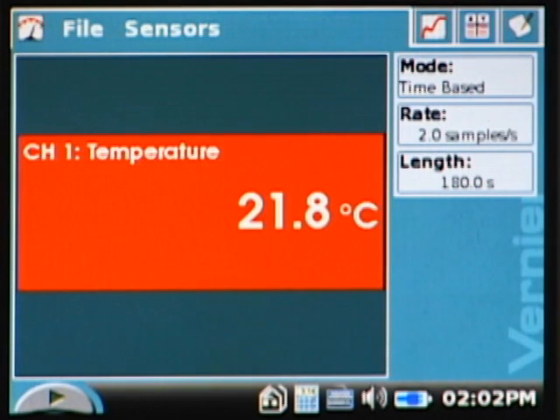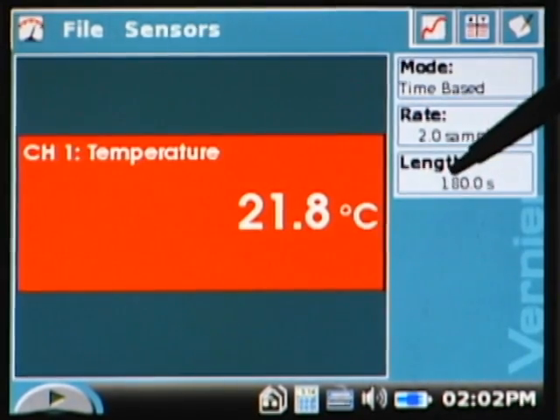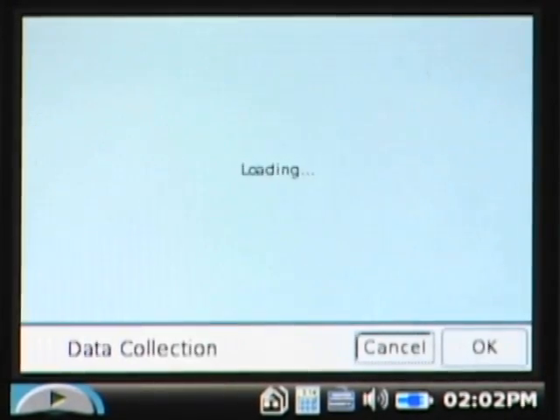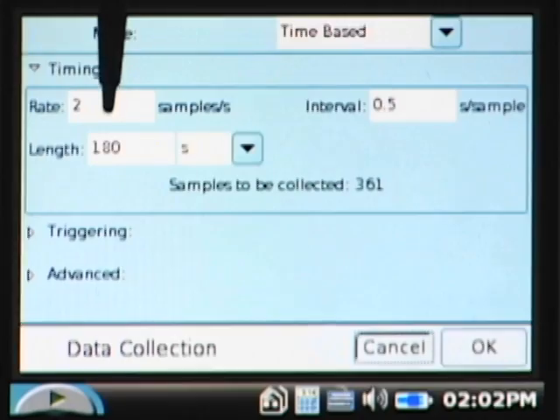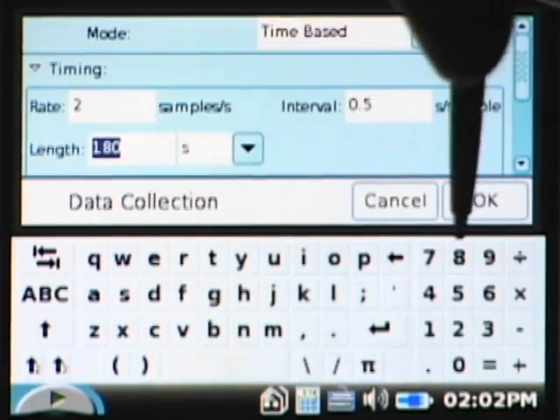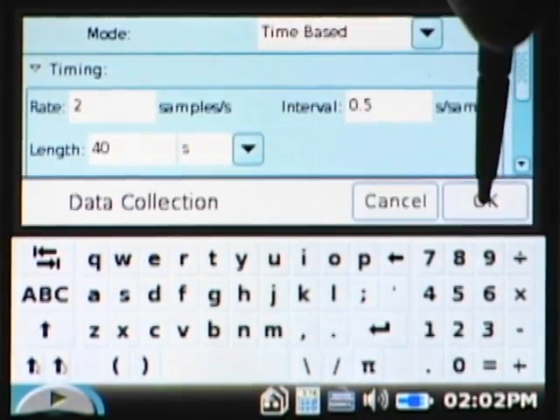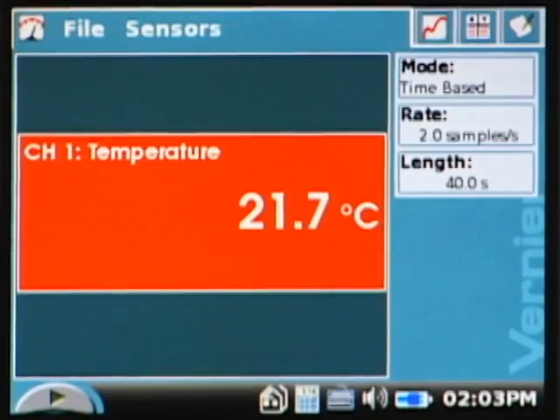In the lab, it doesn't want us to use that long of time, so we need to change that to 40 seconds. It's very easy to do. I just come down and tap on length, and I can change my experiment length. Instead of 180, I want 40 seconds. I say okay, and now my experimental length is 40 seconds.